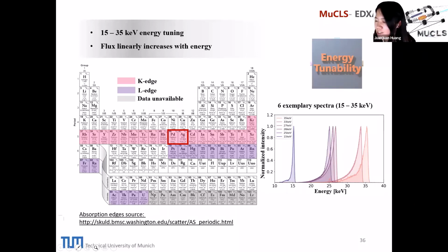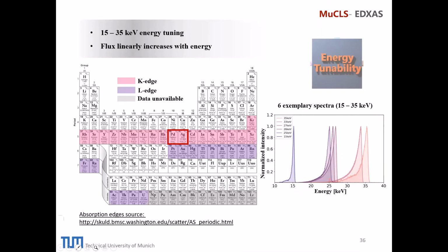Yeah, so essentially the X-ray beam should get the polarization from the laser. That's completely right. You could change the polarization of the laser, but this optical cavity also accepts and stores best a given polarization.